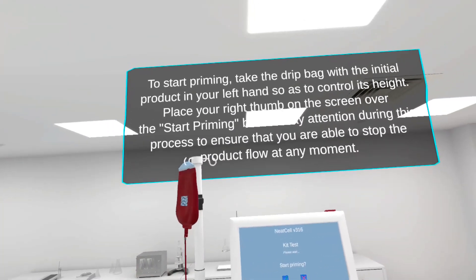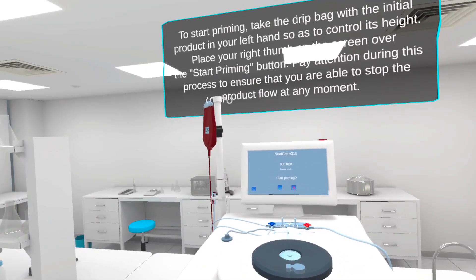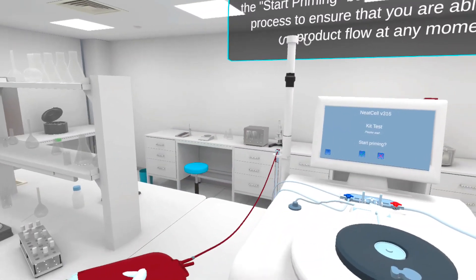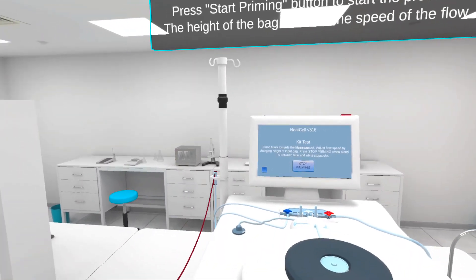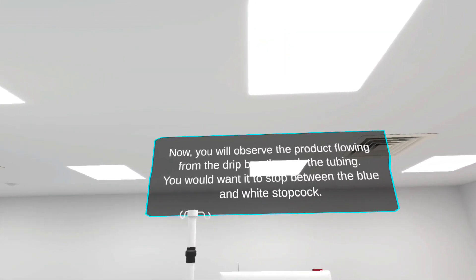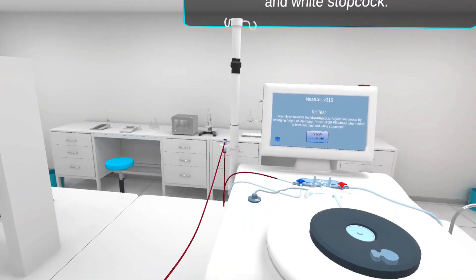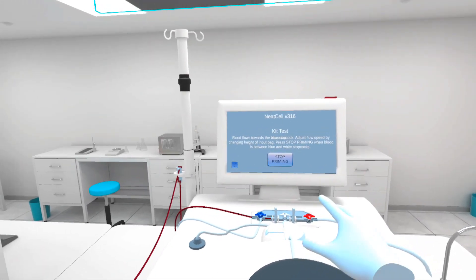To start priming, take the drip bag with the initial product in your left hand so as to control its height. Place your right thumb on the screen over the start priming button. Pay attention during this process to ensure that you are able to stop the product flow at any moment. Press the start priming button to start the process. The height of the bag controls the speed of the flow. You will observe the product flowing from the drip bag through the tubing. You would want it to stop between the blue and white stopcock. Once the priming is finished, press the stop button.